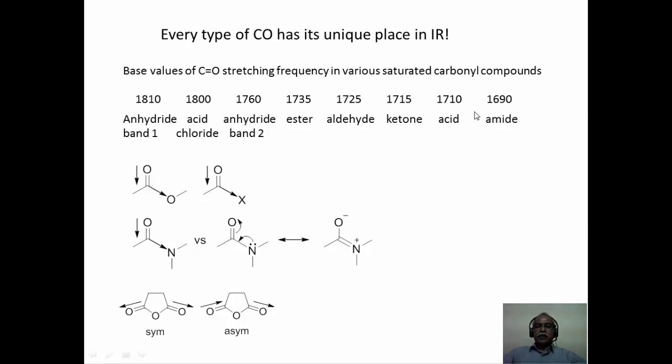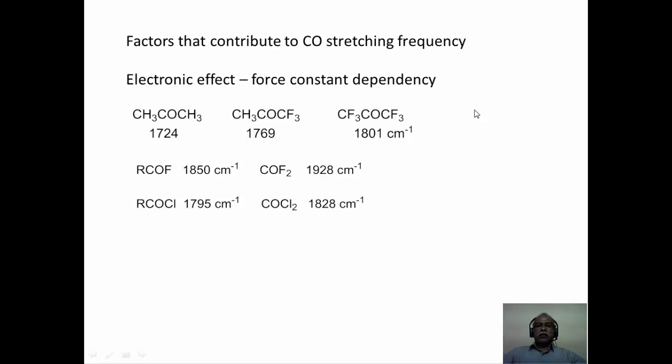We will look into the effect of hydrogen bonding and other electronic effects in the next few slides. Now the factors that contribute to the carbonyl stretching frequency: first we will consider the electronic effect. We are comparing the force constant dependency on the electron withdrawing nature of the groups attached to the carbonyl functional group. We are comparing acetone, trifluoroacetone and hexafluoroacetone.